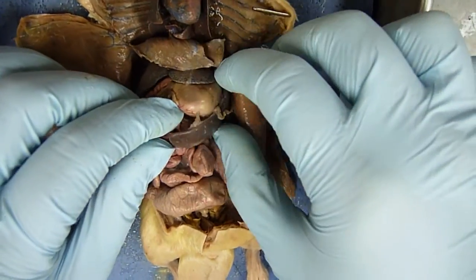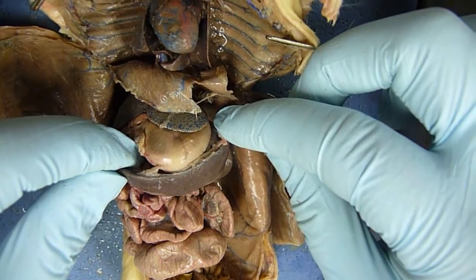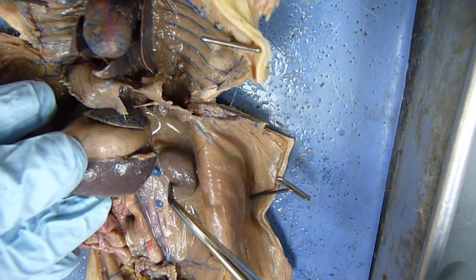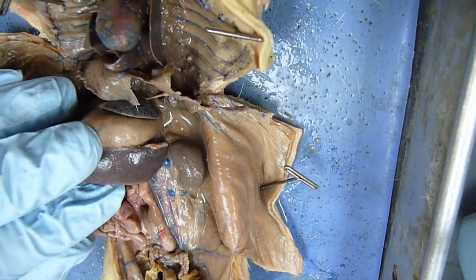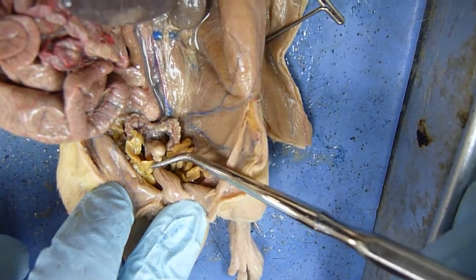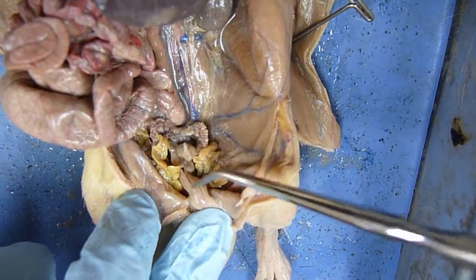This long, oblong brown organ here is the spleen. Then if we push all the organs to the side here, we see the kidney, which of course looks like a bean, hence the name kidney beans. Then down here, we get all the reproductive organs, which I'm not going to go over, but I do want to point out the bladder, which is a little tiny bag.